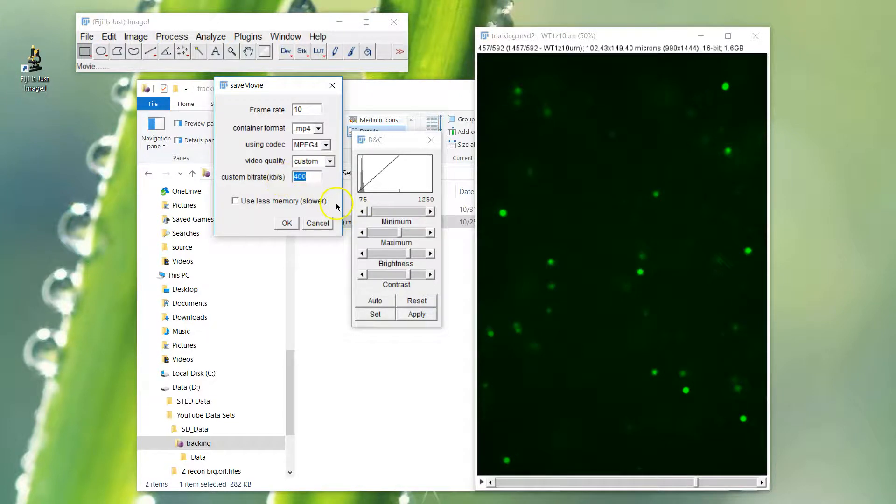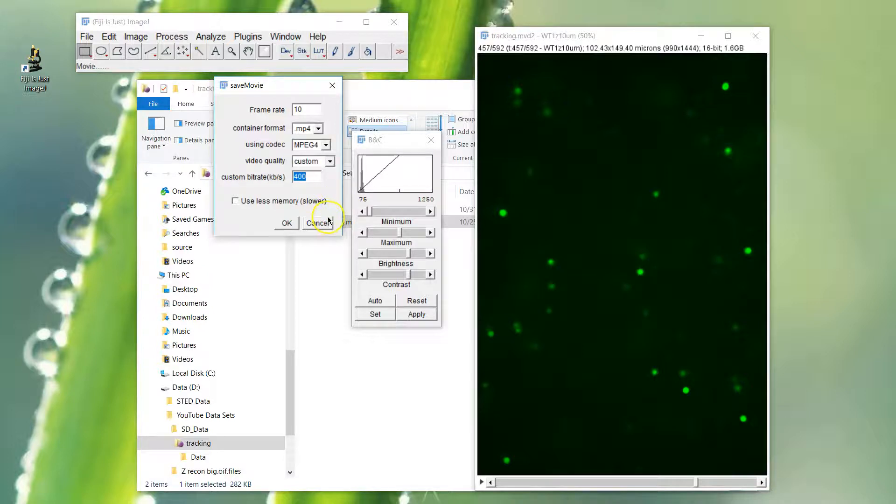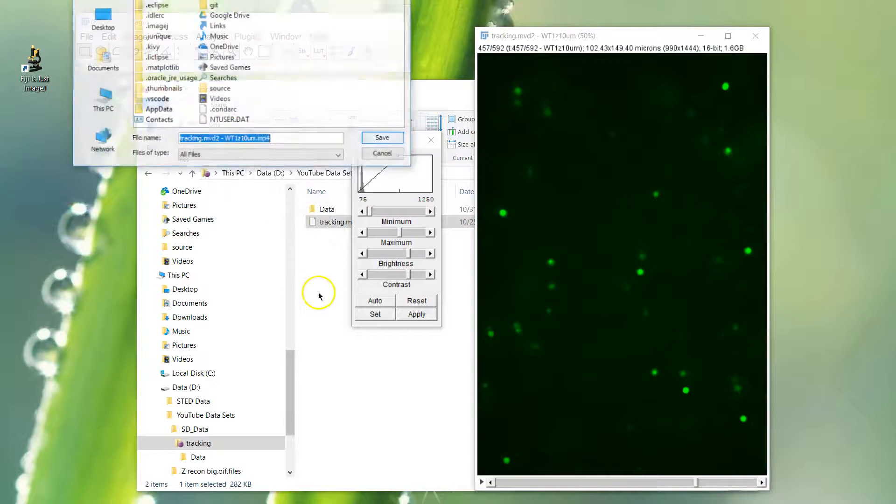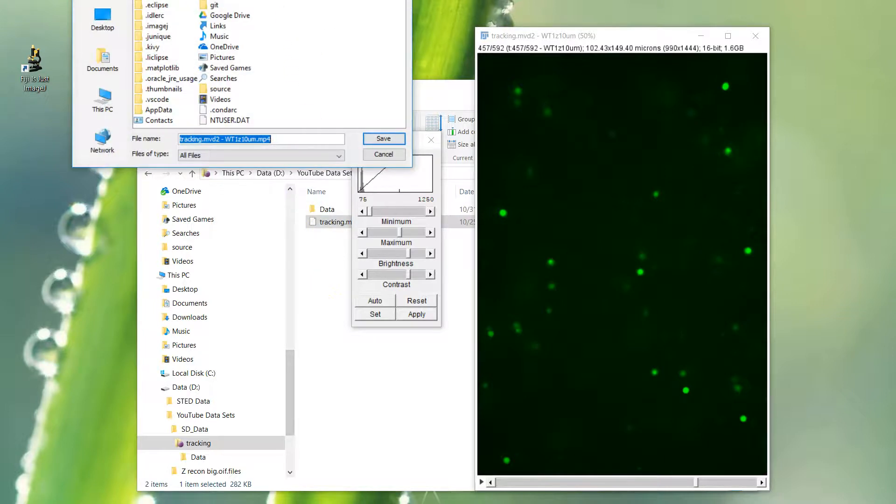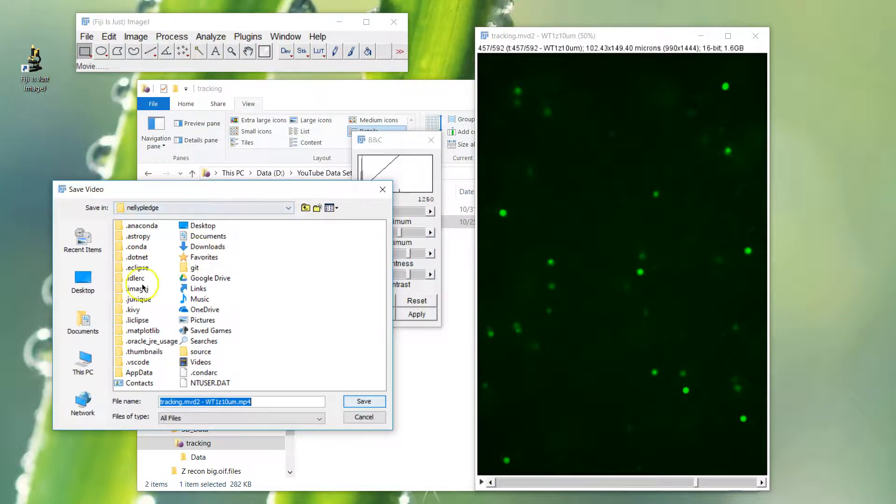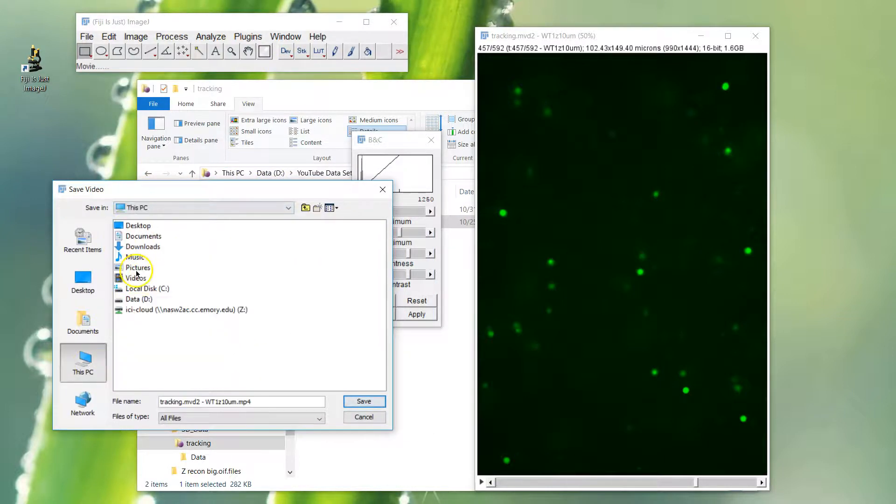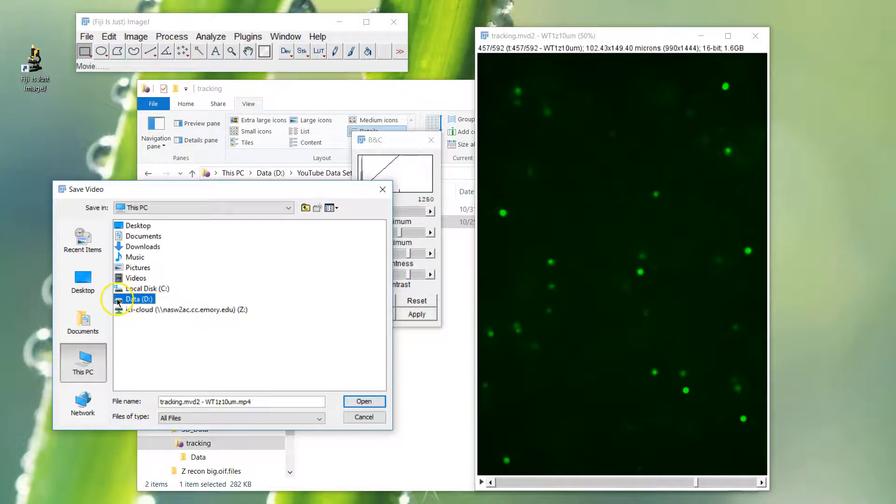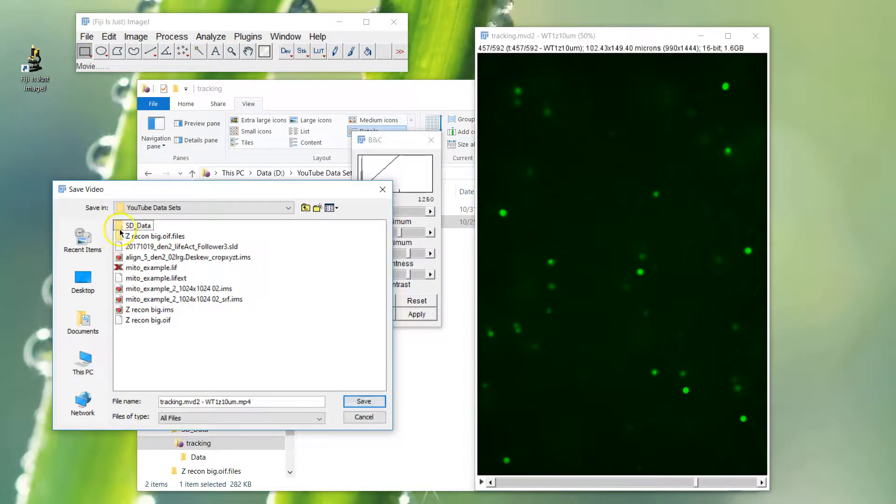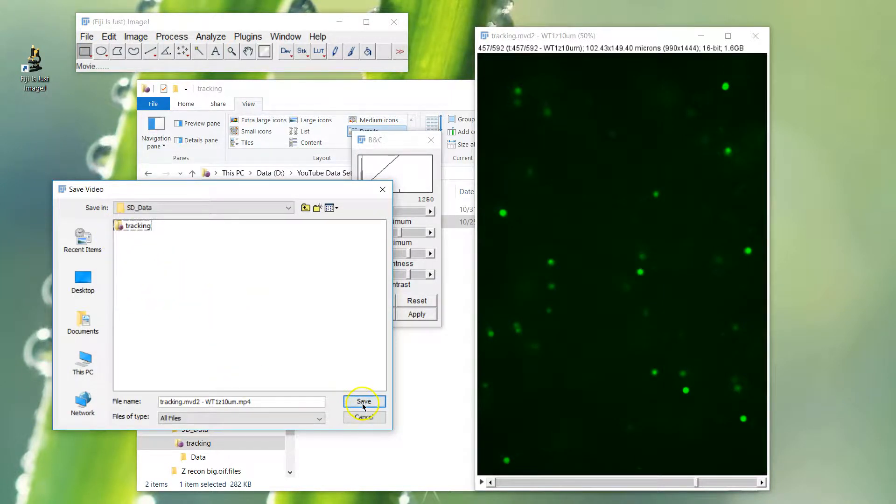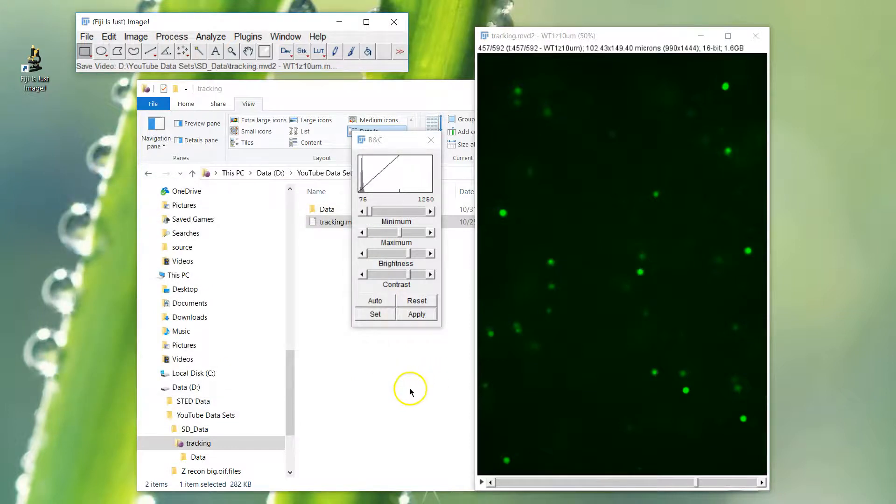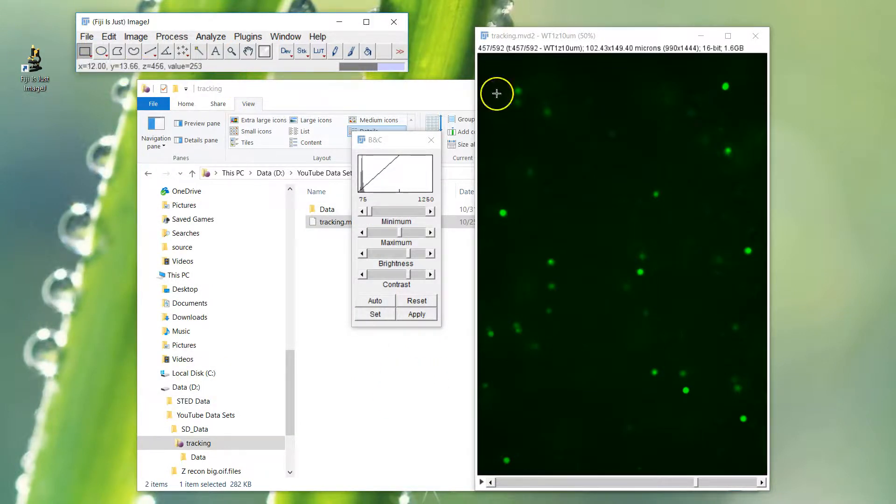Lower bit rate will give you a smaller file, but it will become kind of choppy. This seems to be a good number. You just kind of want a movie to show people, you're not going to analyze it, so keep it lower so the file sizes are reasonable. We go ahead and save it. It doesn't remember where you were last, unfortunately.